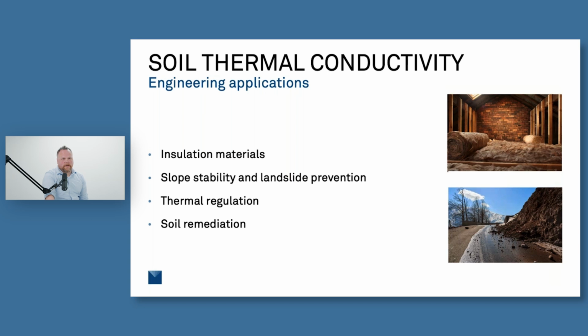These rely on the soil's ability to transfer that heat to actually remove these contaminants from the soil. So understanding how well that soil actually transfers the heat will be a key to helping us successfully remove these contaminants.